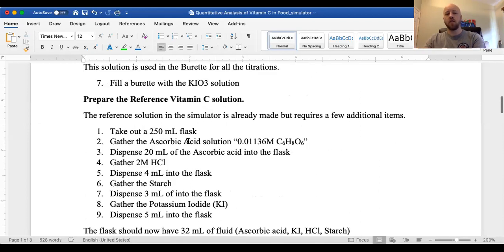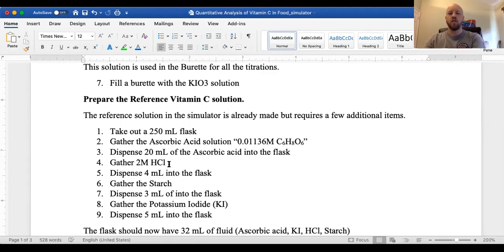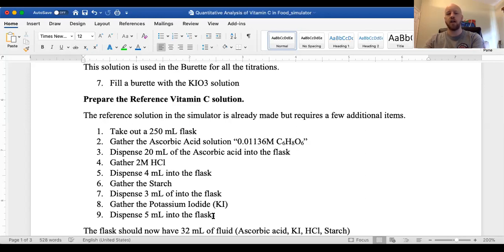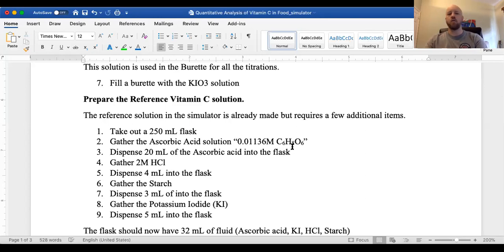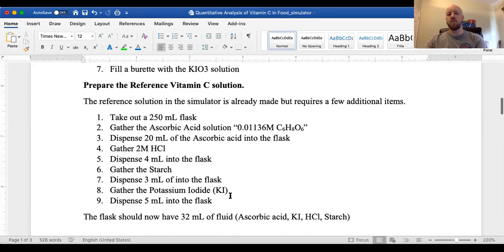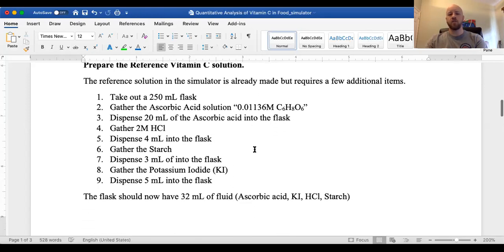In part A, the reference vitamin C, each sample that we're titrating is going to be done the same way. So we have hydrochloric acid that's added, starch is added, and essentially an excess potassium iodide is added to each sample. In part A, the reference ascorbic acid is already made for you. That's kind of where the difference is from the handout. This one already has a molarity for the ascorbic acid, whereas in the handout we were just scooping out ascorbic acid standard. So you have to do some calculation to get to the mass of ascorbic acid.